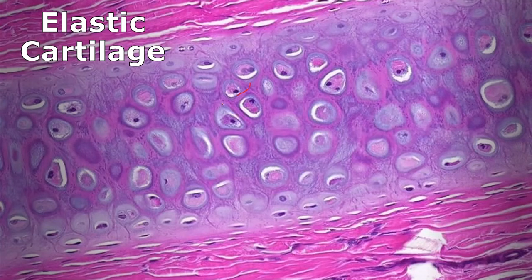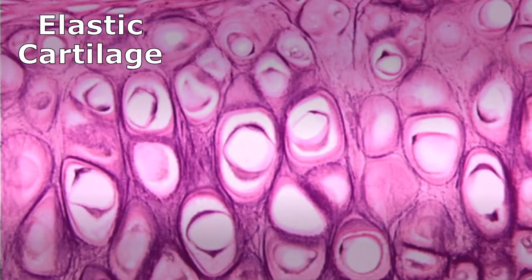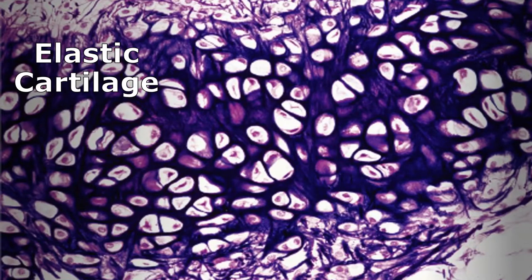In these additional elastic cartilage images, I can see chondrocytes in lacunae. The matrix may look smooth at first but look closer — there are lots of cracks in the glass, dirty matrix. The key is looking at the matrix to determine the type of cartilage. The dark staining and black cracked matrix in the background confirms we're looking at elastic cartilage.